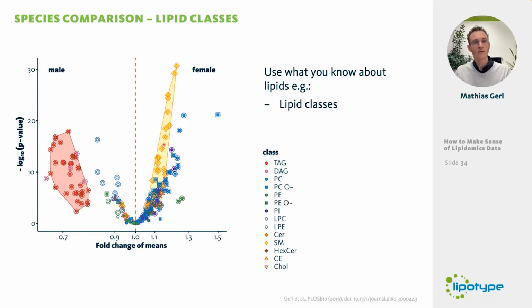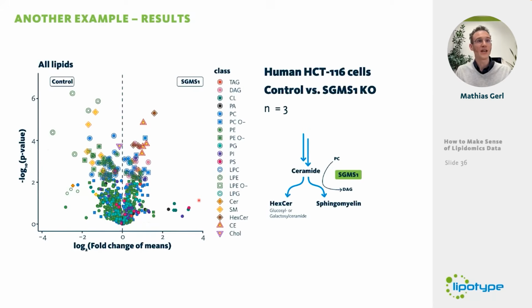And then you could even drill a little bit deeper and look at these sphingomyelin species and see that all of them, which are highly significant up here, actually have 2 double bonds, which is a signature of a specific sphingoid base in blood. So these are results you can get from there. This is obviously an example which works very well because you had 1,000 plasma lipidomes and you can get really nice p-values up to 30 on the axis. What you usually have is more something like this.